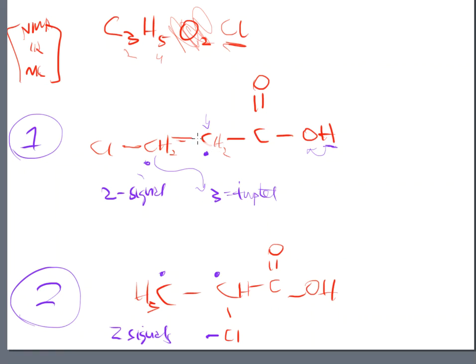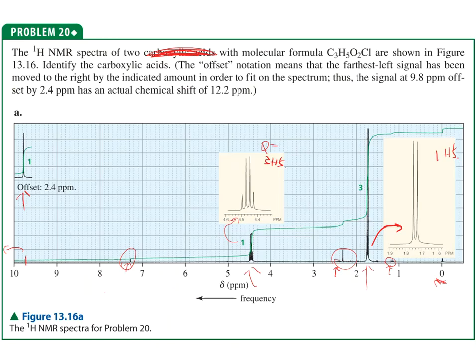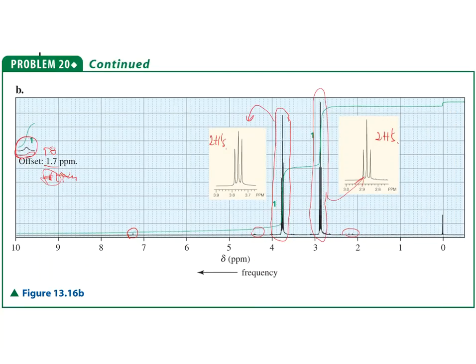Next door are no protons, and next to that one, we have 2 protons. So that's also going to be a triplet for that one as well. So for one of these compounds, I'm going to see a triplet for both signals. All right, if I go to this one, I actually see a quartet and a doublet. That really doesn't match the predicted NMR spectra, does it? So that's probably not the NMR spectra for that one. If I look at B, well, this signal's a triplet, and that signal's a triplet. Ta-da! We did it! That's the NMR that matches what we've drawn.